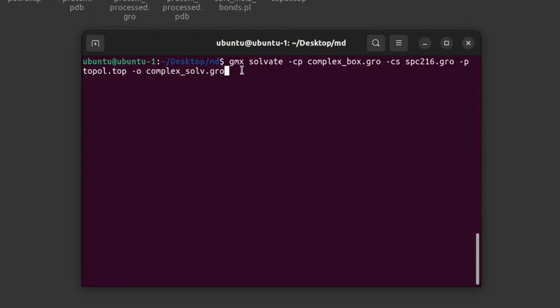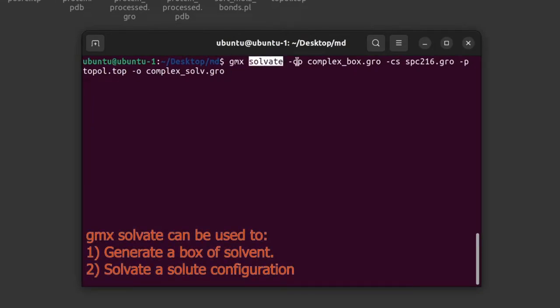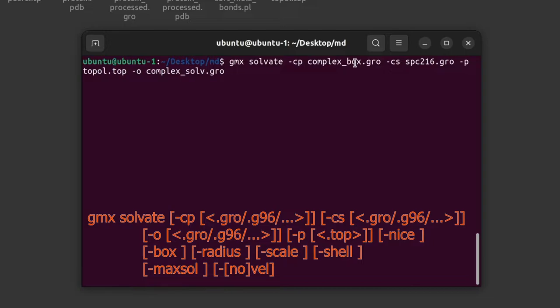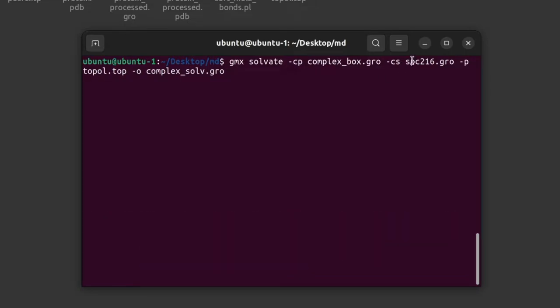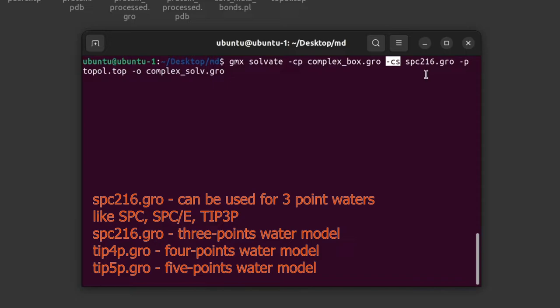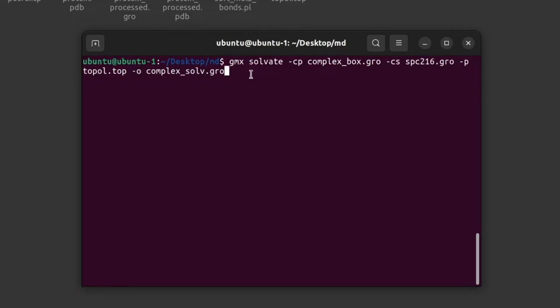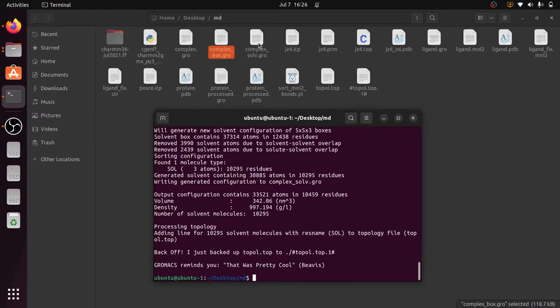Now to solvate the box, give this command: gmx solvate -cp complex.box.gro (the protein configuration file, which is the output of the previous command) -cs spc216.gro (the solvent configuration — this water configuration file is present in GROMACS itself, so we do not need it in this folder) -p topol.top to update the topology file, and -o complex_solv.gro as the output file. Press Enter and a new file complex_solv.gro is created.